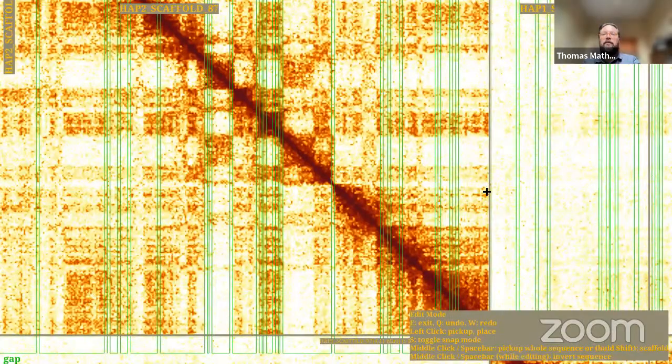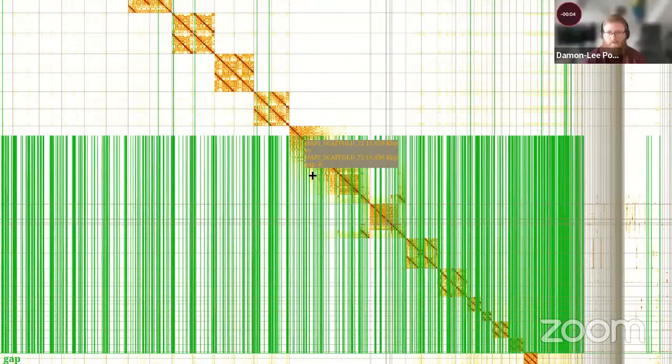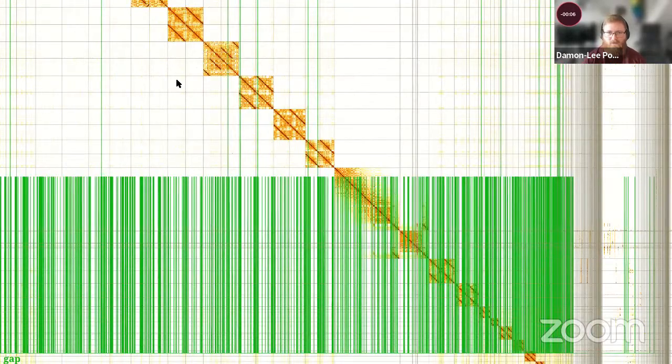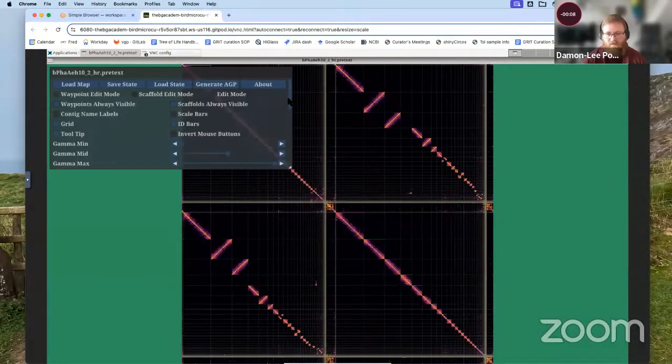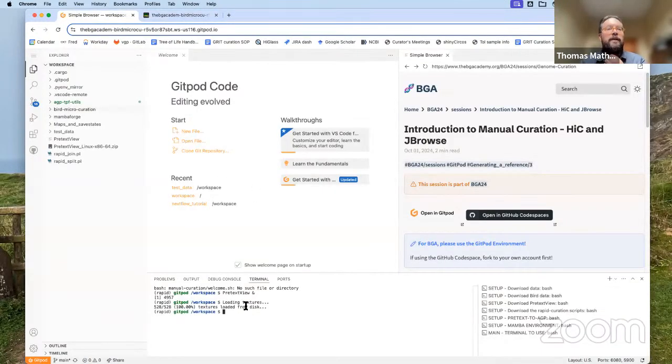Okay, so this looks like probably it breaks off here. Beginning. That'll be your warning. Okay, to go into your Git pods and have a click around. Right, so if everybody wants to go into, we can just type something in the terminal, and that should keep it going.